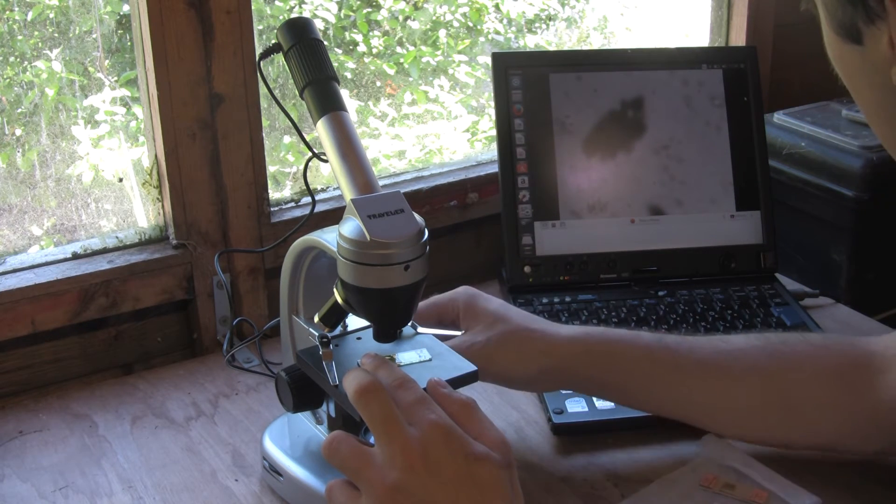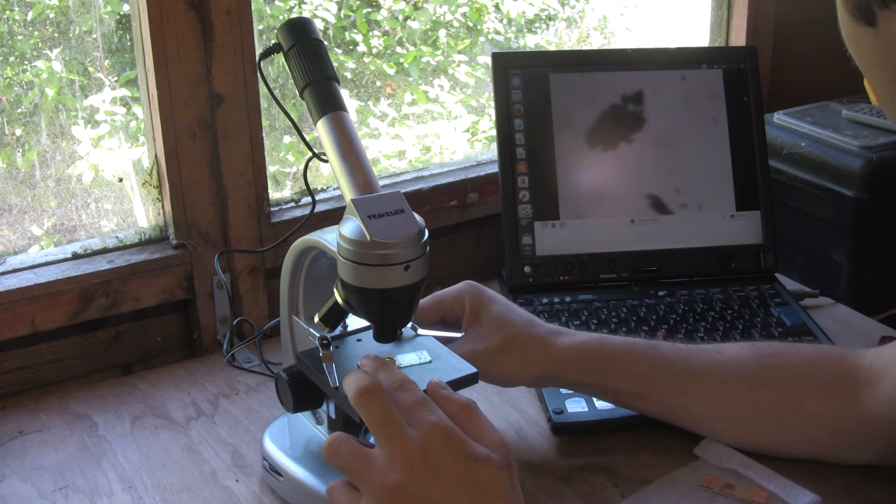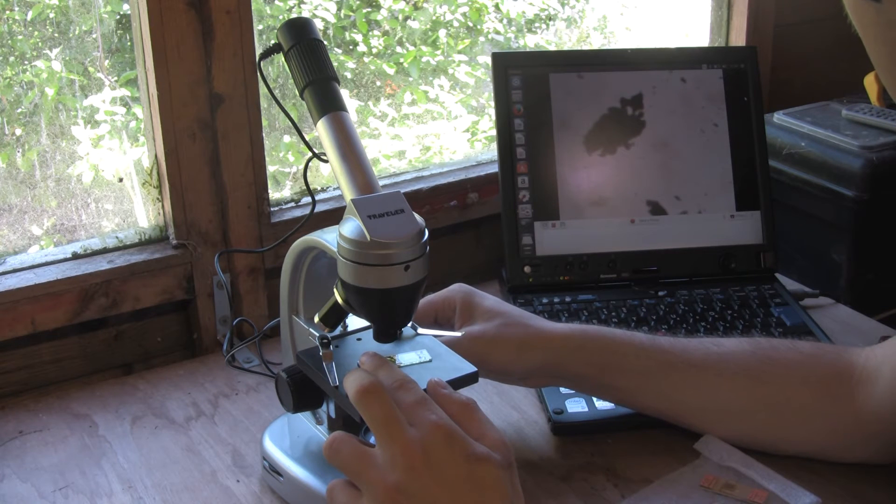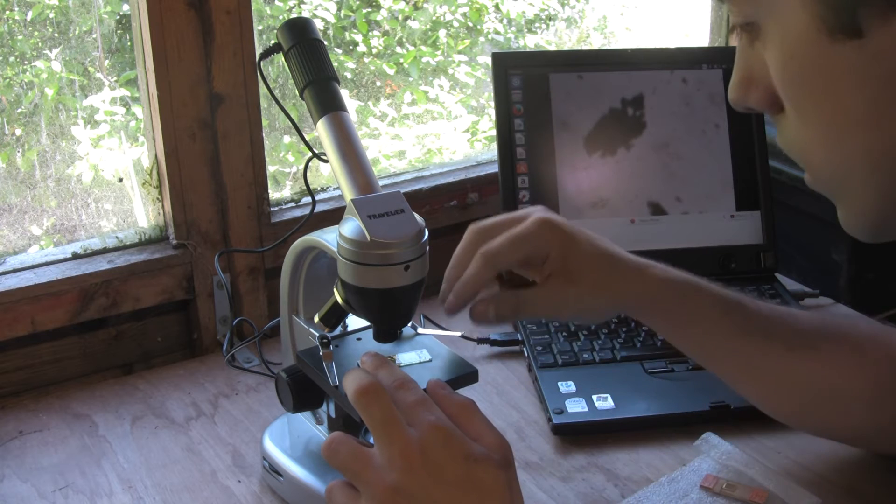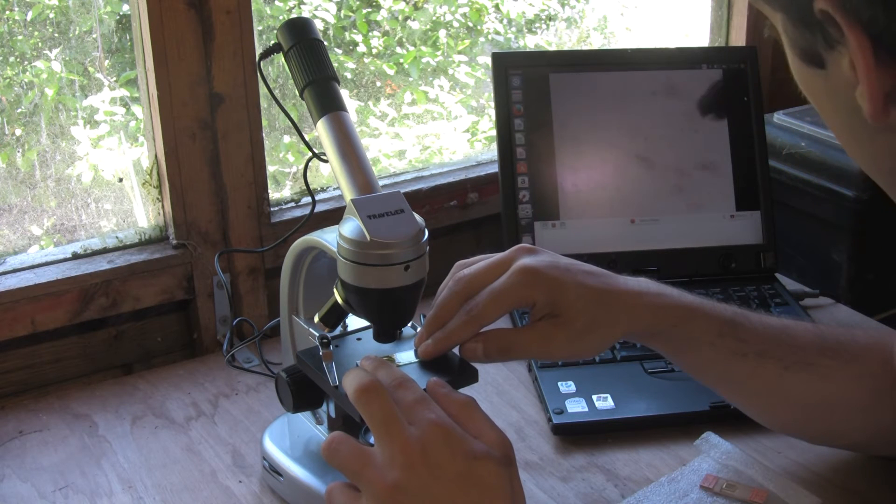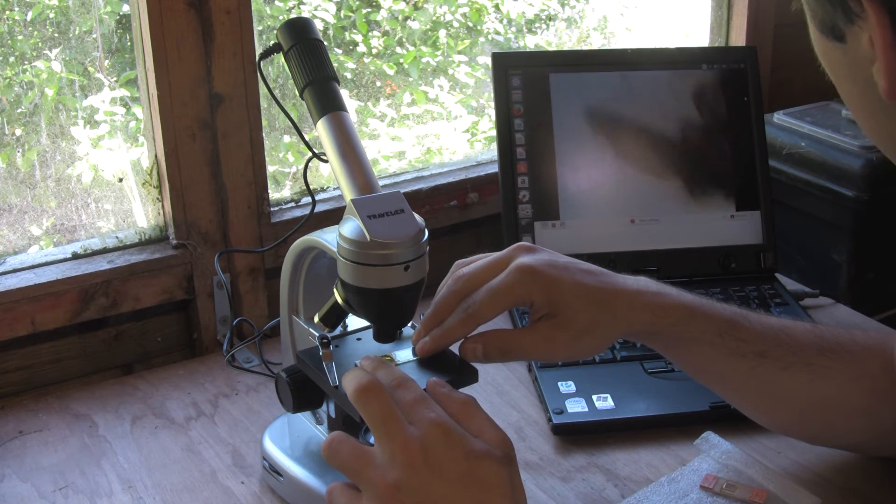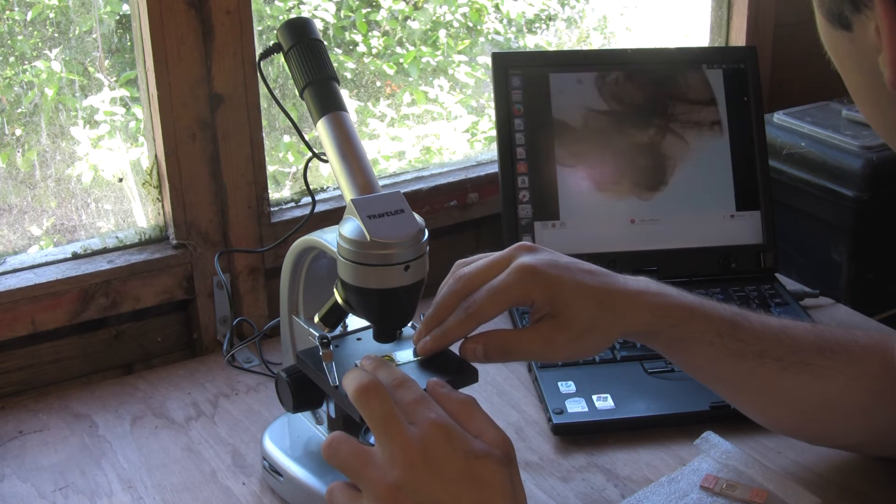There? Or is that bit of dirt? I think that might be a bit of dirt there actually. Oh there we go. There's our flea.